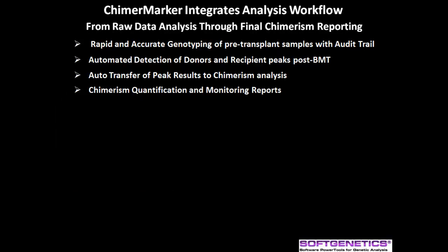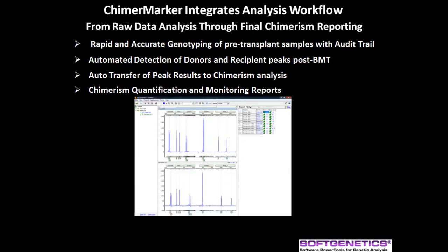ChimerMarker integrates analysis workflow from raw data analysis through final chimerism reporting. Analysis starts with rapid and accurate genotyping of pre-transplant samples and includes an audit trail of all actions. ChimerMarker is compatible with all CE systems and human identity chemistry for rapid, accurate size and allele calls. The introductory webinar has details on compatibility, user management, password-protected control of access rights, and automated audit trail.